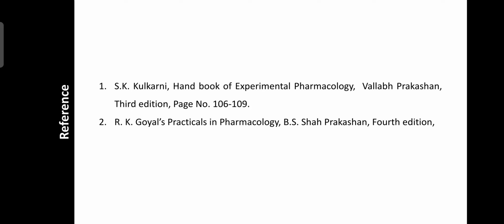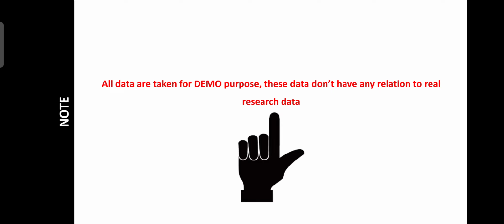These are the references. We prepared this video tutorial regarding the determination of the PD2 value. All the data are taken for demo purposes, so these data do not have any relation to real research data.